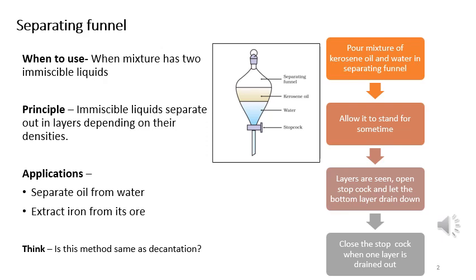The picture on the slide is of a separating funnel. We would also be doing this in the laboratory once you come back to school.